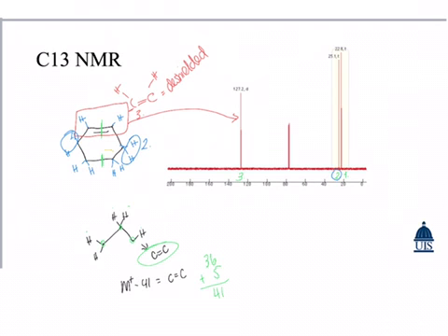And the last one is going to be the farthest away from the double bond, known as carbon environment number 1.